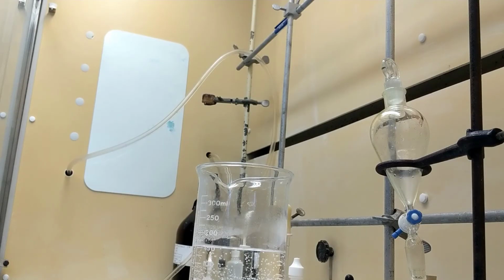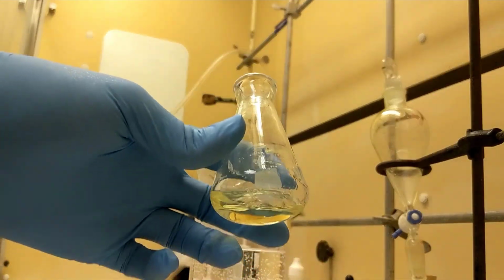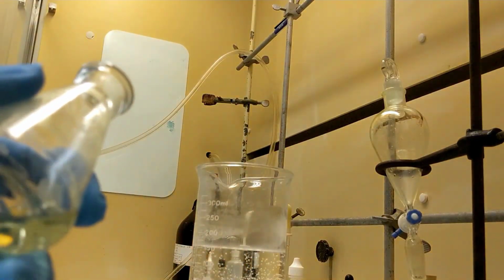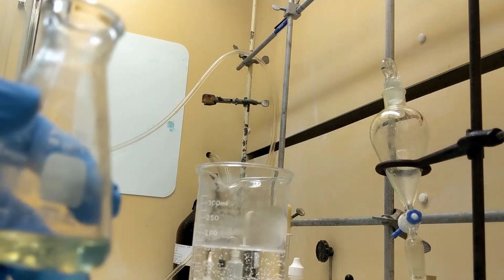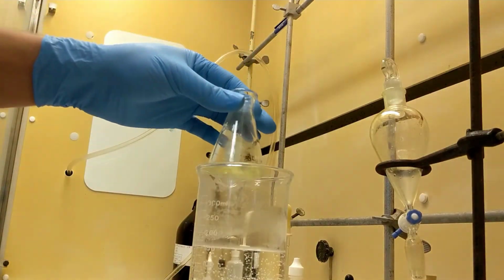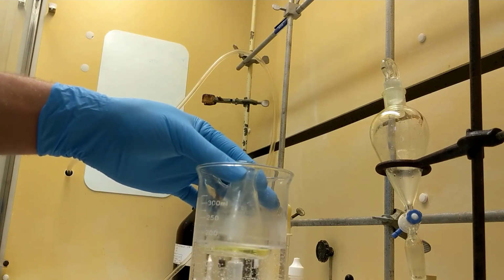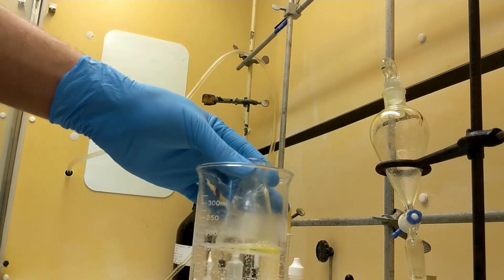Here we go, guys. It's the finale. Erlenmeyer flask. Ether and unknown A dissolved inside after extractions in NaOH and cleaned and dried. Okay? Now I'm just going to evaporate off the ether by putting it in a warm water bath and adding just a little bit of air. Alright? Can you guys see? Yeah, I hope you do.